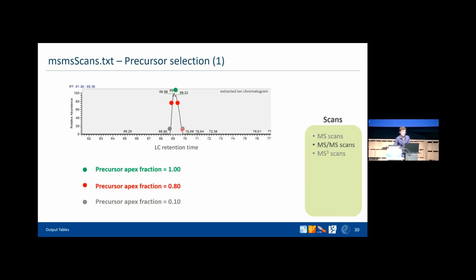And so you can say, okay, if this is very low or very high, should I do this? If this value is very low, but you set your method so that it still should do second MS if intensity is very low, then maybe it's not worth it. You're just wasting time and energy on this. So this tells you something about how to set the parameters of your spectrometer.